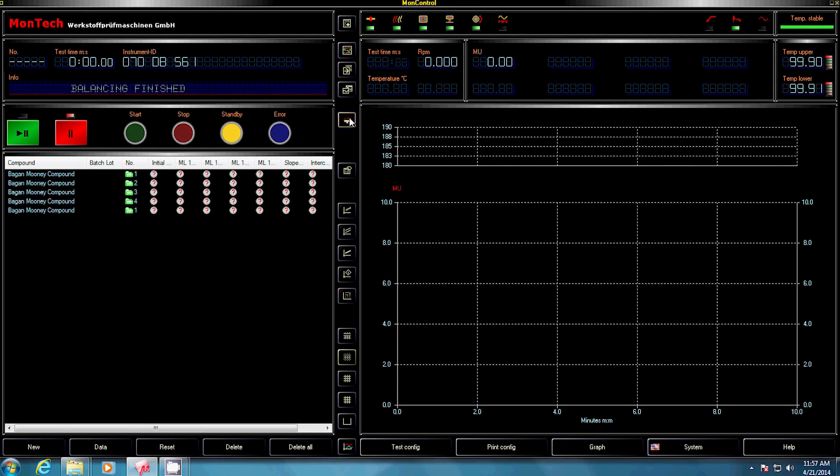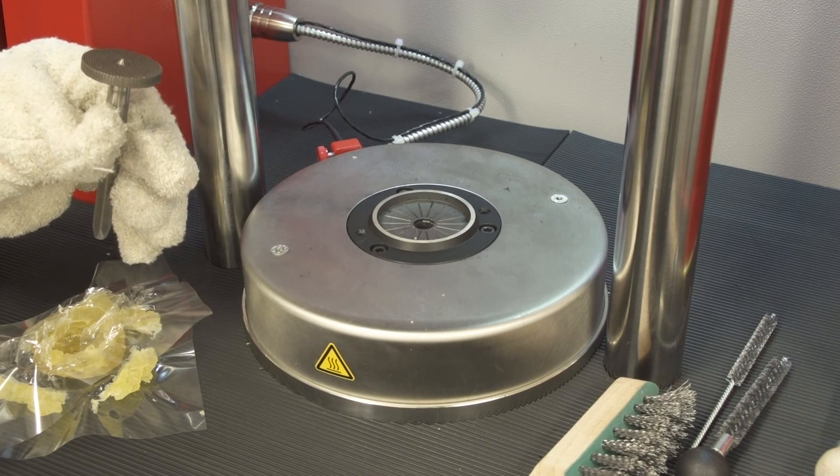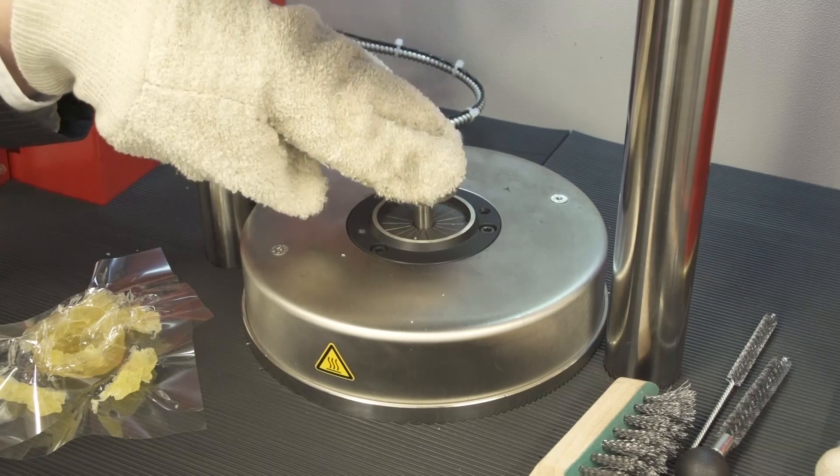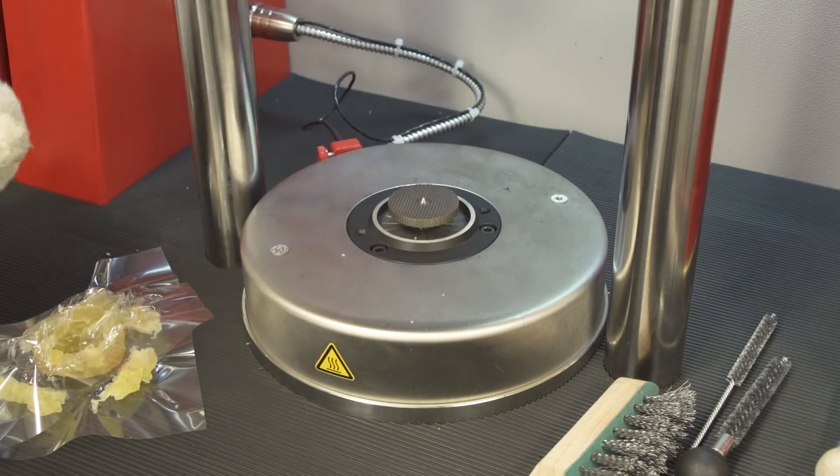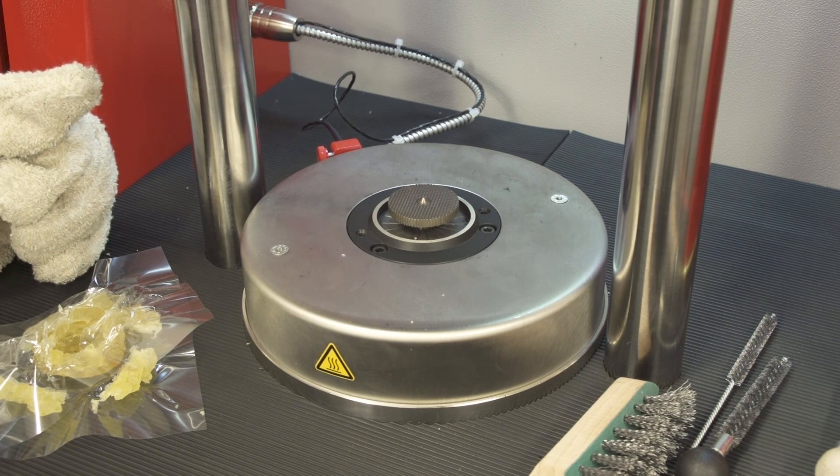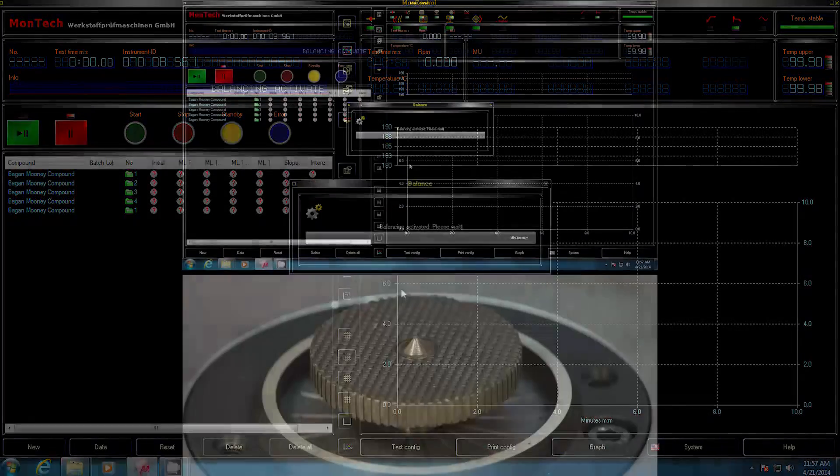To start the balancing, select the Mooney balance function, which can be found in the center of the MonoControl software. The Mooney balance is done without any material inserted. Put the rotor into the dies and make sure that there are no tools or other items and no test material in the working area. Click OK to proceed with the balancing.